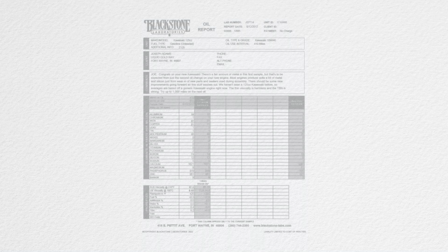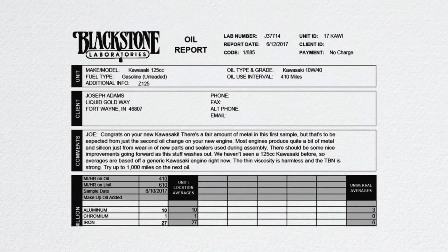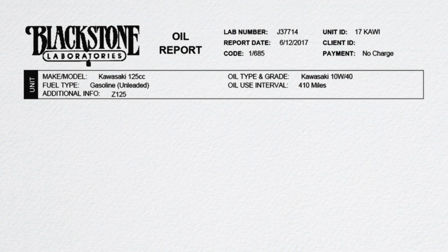And here we have the Blackstone Labs oil report. It's a one-of-a-kind presentation of the data in an easy-to-understand manner. Now, there's a lot of numbers we're going to break down here, so stick with me. We're going to go through the sections one by one. To begin, we need to break down some clerical details.